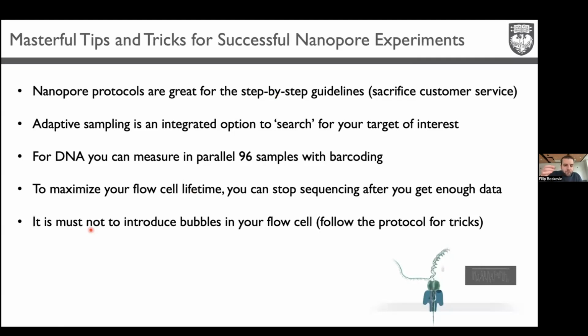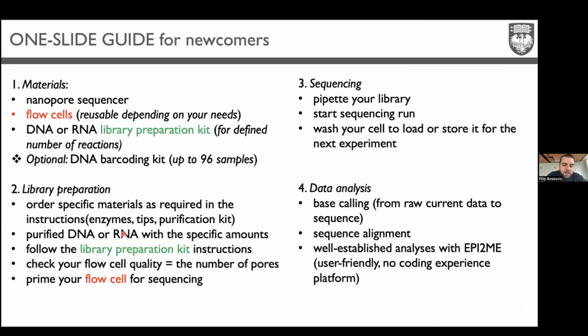change your volume. So if you have 200 microliters, you can just hold your pipette and then increase a bit to 230, and then the liquid from the device itself will go up. In that way, you can ensure that you didn't introduce a bubble, and then you add your sample, and all should be good. So keep that in mind. That's probably the most important piece of advice.